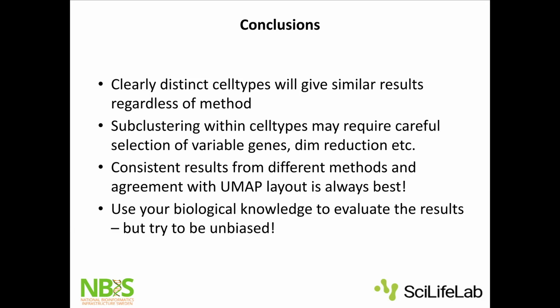It should be used with care, this pre-selection of genes, because there is a risk that you bias your data, and there is clearly a risk that you will lose information that you might discover otherwise. But for sure, there's a lot of people that do it, and it does work.